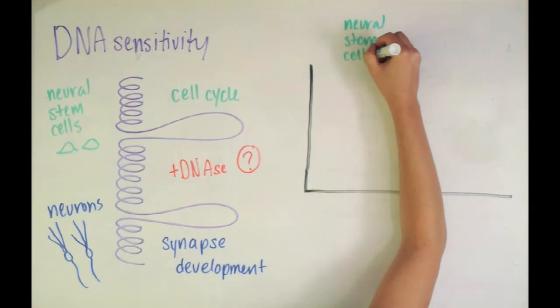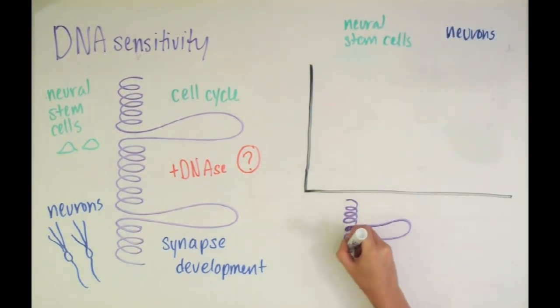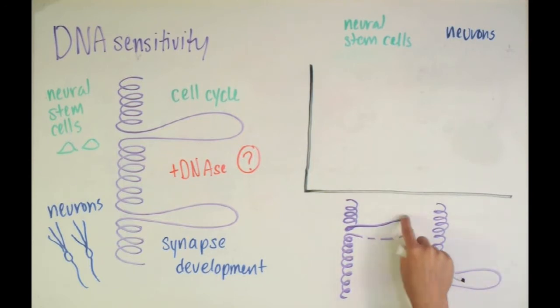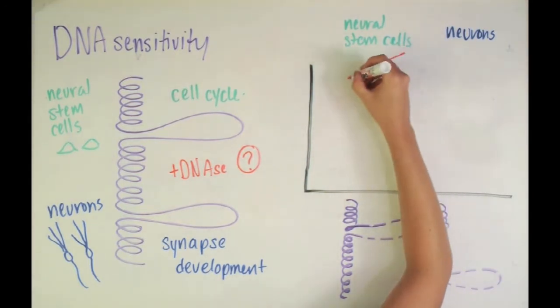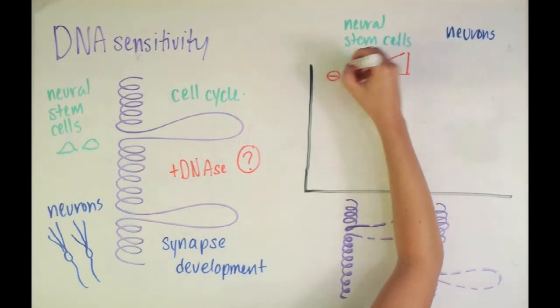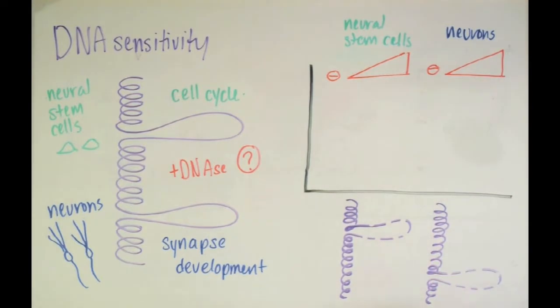Let's set up the blot. This is the chromatin configuration that you would expect to see for each cell type. Back to the gel, I've indicated DNase concentration above with the triangle. Based on the probes we designed, the genes show up at 2 different sizes.